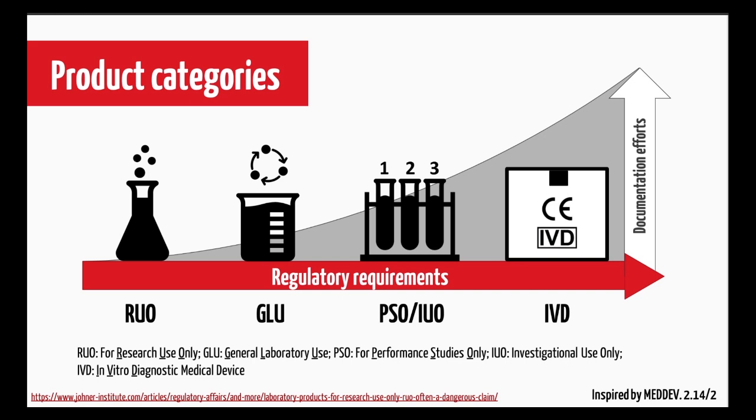These documentation efforts increase very much on the right-hand side, and there are not only those few requirements on the CE IVD level regarding analytical and clinical performance data. There are also the post-market surveillance activities and the vigilance activities and all the other articles, unique device identification, a lot of requirements that have to be fulfilled for IVD products.